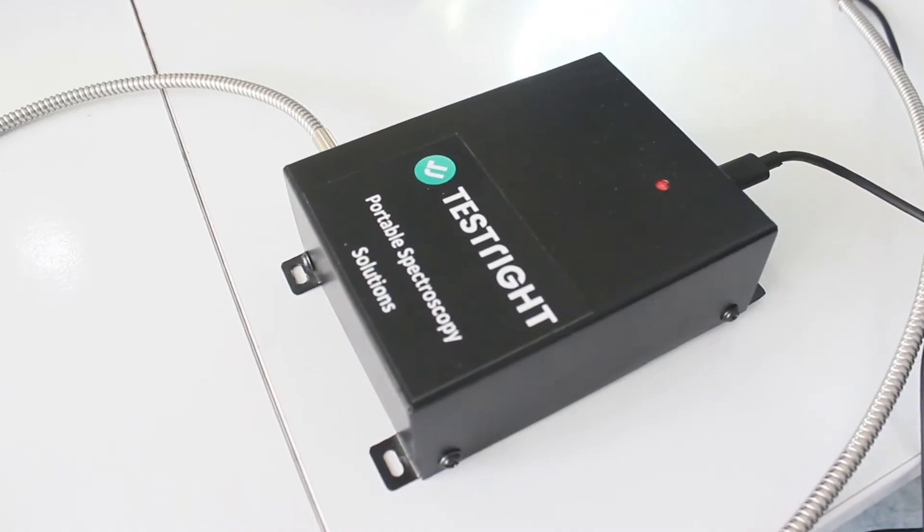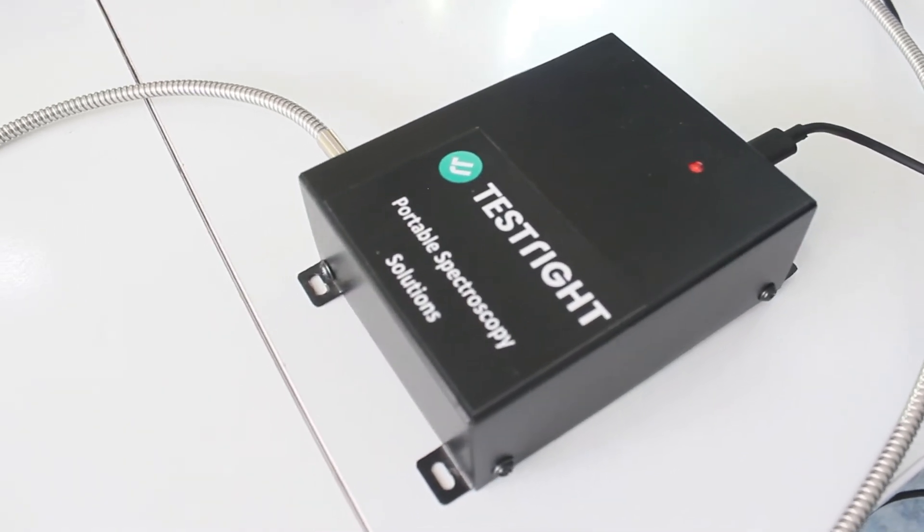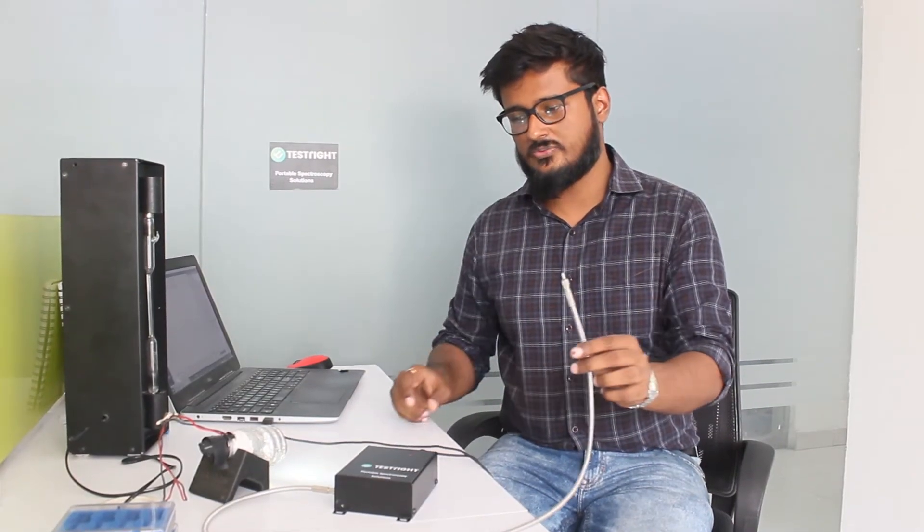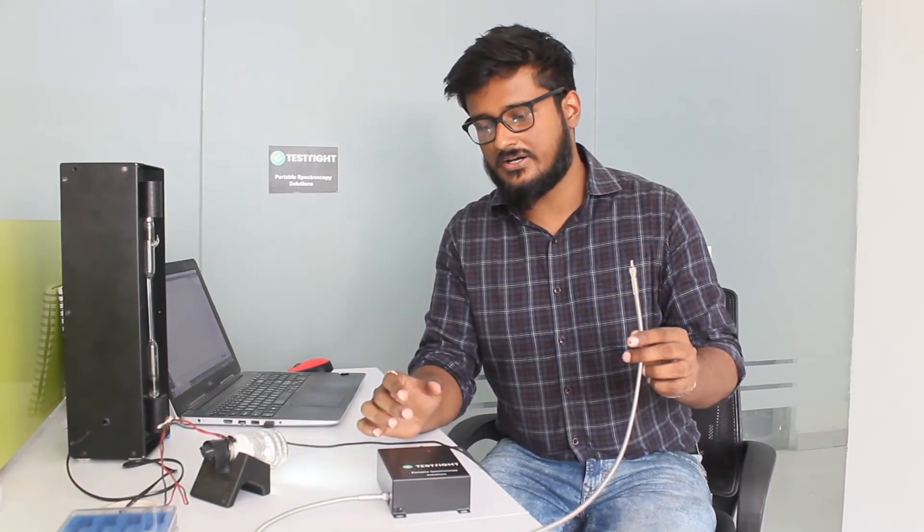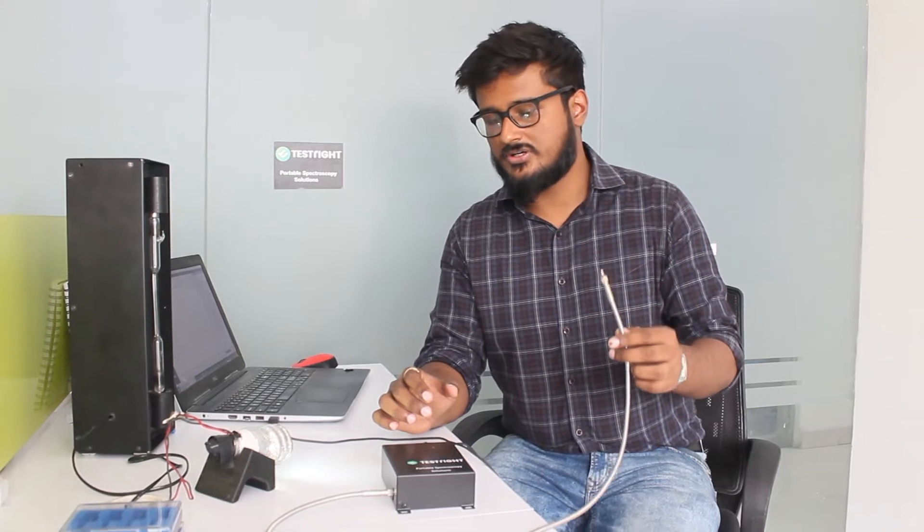You can see it here. It's called the Prism Spec and here we have an SMA connected optical fiber that we are using.